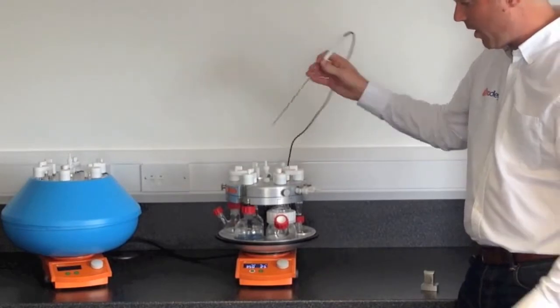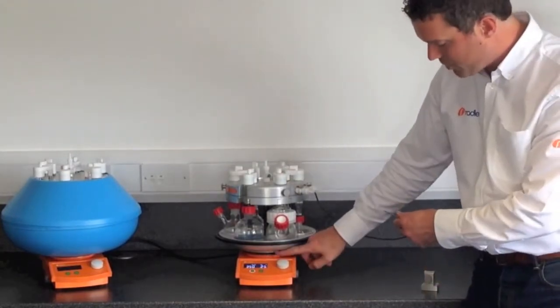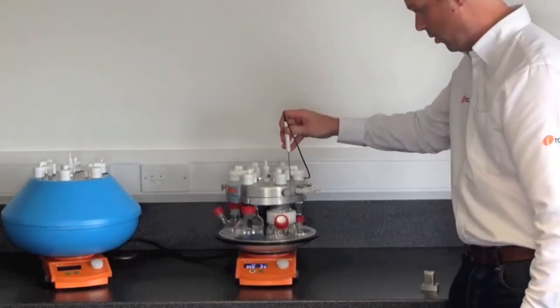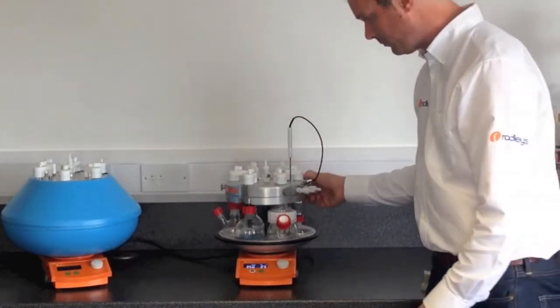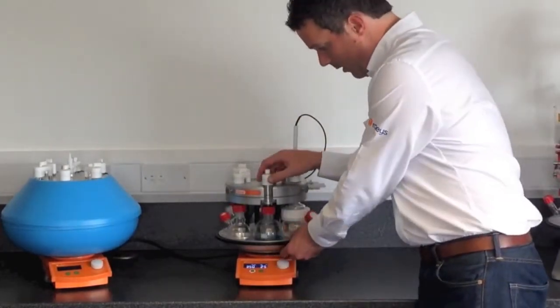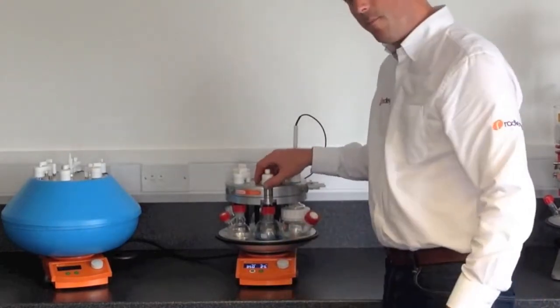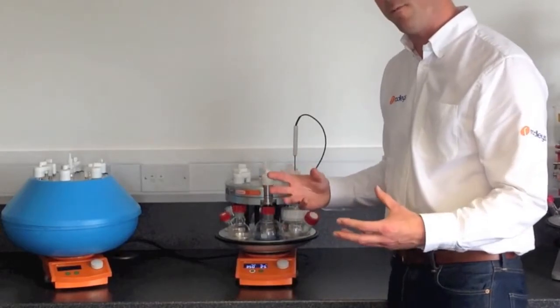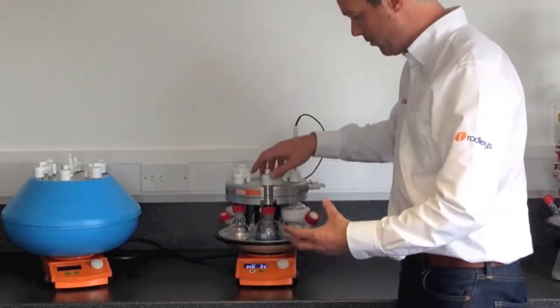You can control the hot plate by either the hot plate temperature or using a PT1000 probe pushed into the block. The base of the block is made from anodised aluminium — it's solid, so it transfers heat very quickly and very efficiently, meaning all the flasks are at the same temperature.